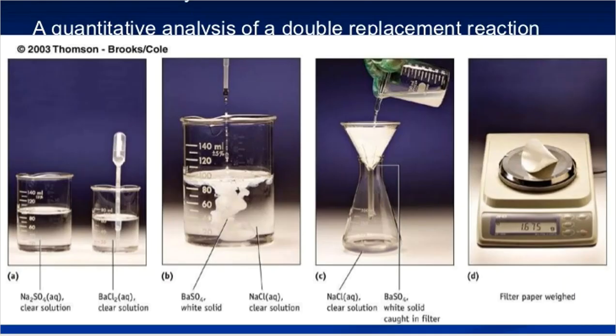All right, so to give you a visual of another gravimetric analysis procedure, here is one on the screen for you. So over to the left in this picture, what you're seeing is a solution of sodium sulfate. And to the beaker on the right-hand side, this is a solution of barium chloride. So barium chloride is soluble. It breaks up just like salt does, NaCl. I know that it's soluble because, look, there's an aq that's listed right here. That means aqueous. That means it dissolves in water.